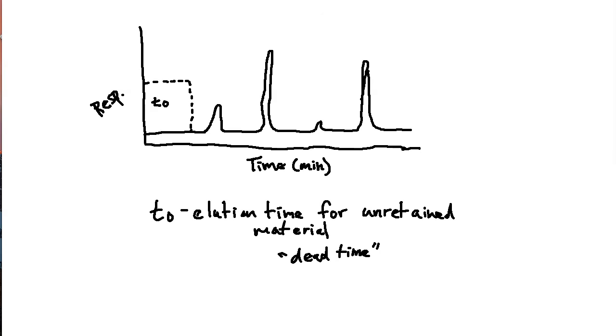All right, so the other important thing that we've been talking about over and over again is the retention time. Now this goes certainly beyond the dead time that we have there out to whatever peak you're currently looking at. So let's say that we're looking at this last peak right here. The amount of time that it takes to go from the dead time out here is TR, and that is considered to be the time of retention.